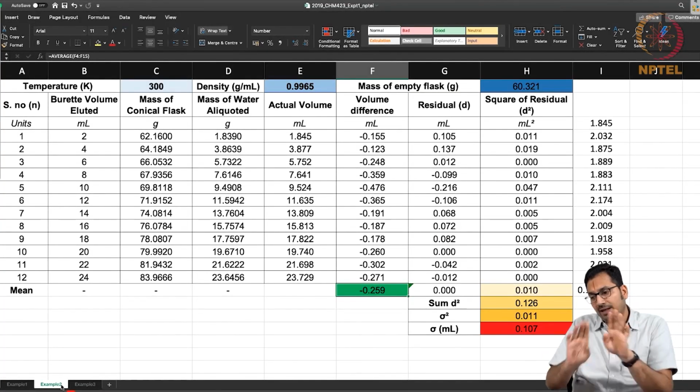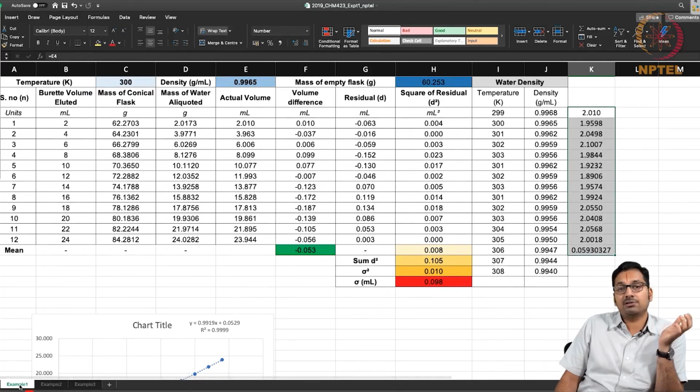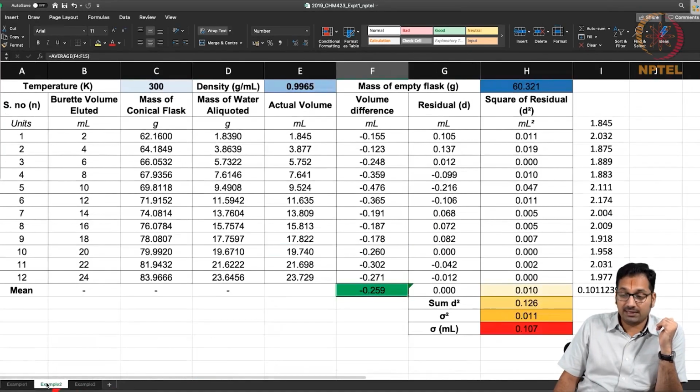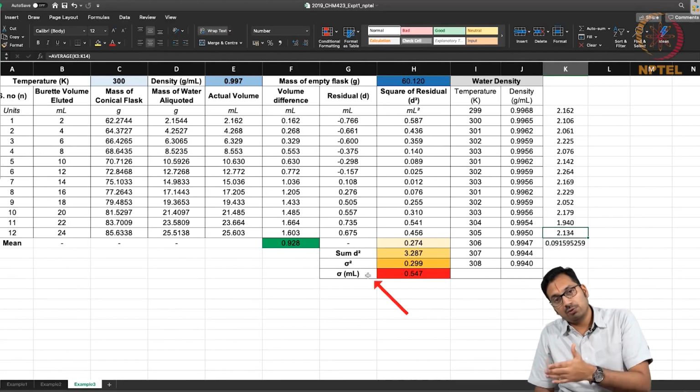Although within 2 standard deviations these 2 measurements agree with each other, even within 1 standard deviation they are just barely close to each other, but definitely within 2 standard deviations they agree with each other. You are able to realize that in comparison to the first researcher who got 2 plus minus 0.06, these 2 people are less accurate and less precise. Accuracy cannot be told for the second guy, where the accuracy is still good but the precision is poor, but in this case you are able to realize that the accuracy is poor, as is the precision.